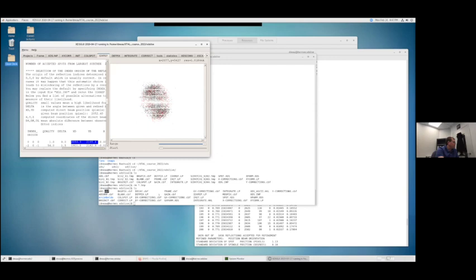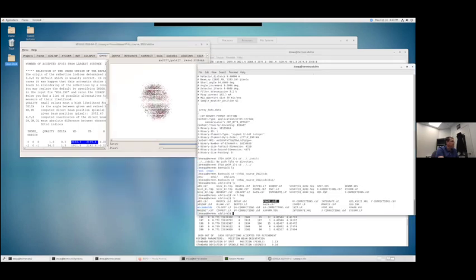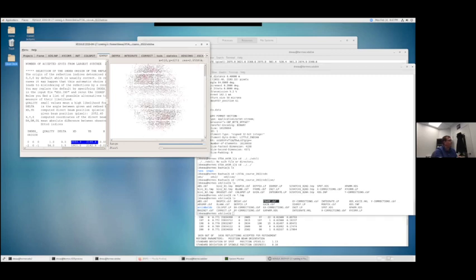Trying to see which one it is. It's the frame.cbf file. This CBF file actually gives the final information from the final frame. And so what XDS GUI has just done is conveniently collected that information as it comes. And so now this is actually displaying for the entire data set the spots that are indexed versus spots that were picked but not indexed, okay? And so actually XDS GUI has a much more useful way of viewing that than this frame.cbf.